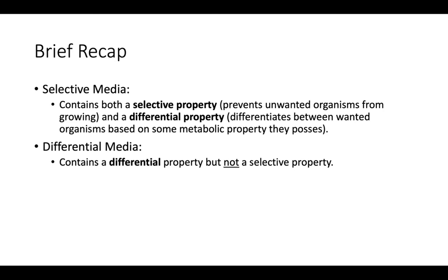So this media contains a selective property, and then it also contains a differential property. So that's going to tell you about the metabolic properties of each organism as they grow on the plate. So you might see if they're able to ferment certain substrates or reduce others based on how they look after incubation. And then you also have differential media.